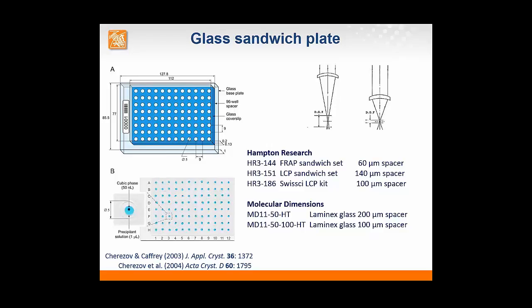So you need to use some special techniques for sealing these plates, and I advise using a glass or wooden stick and pressing in between the wells and also at the edges of the top glass slide in order to properly seal these plates.